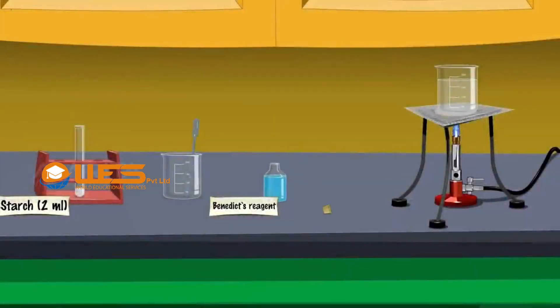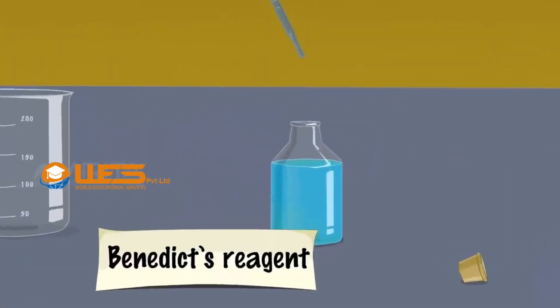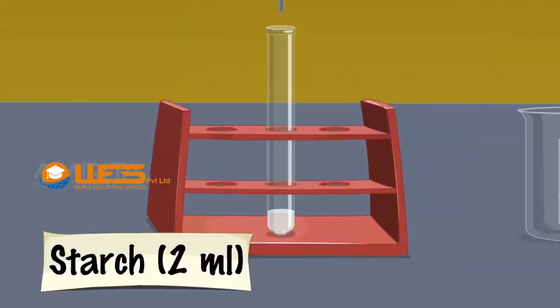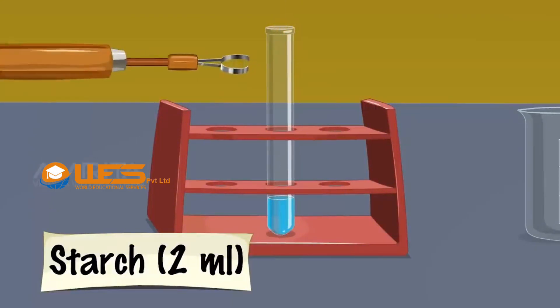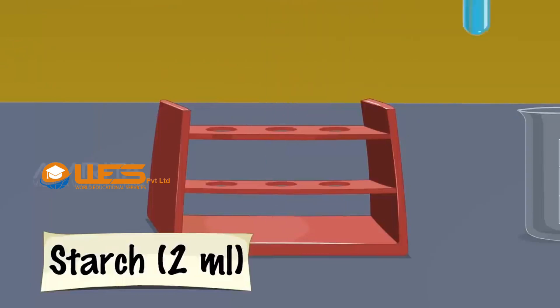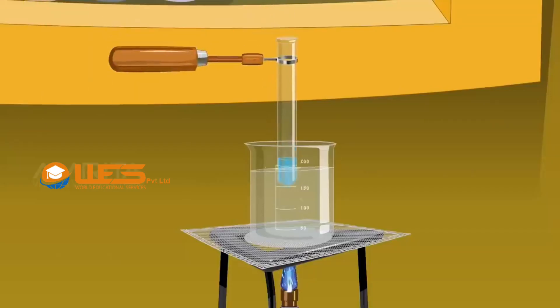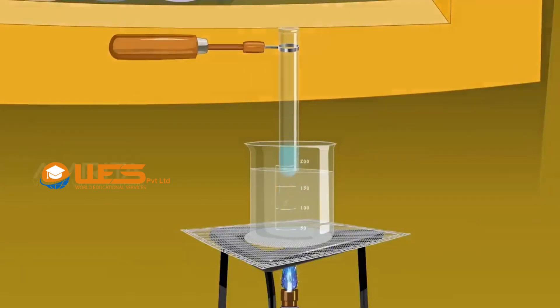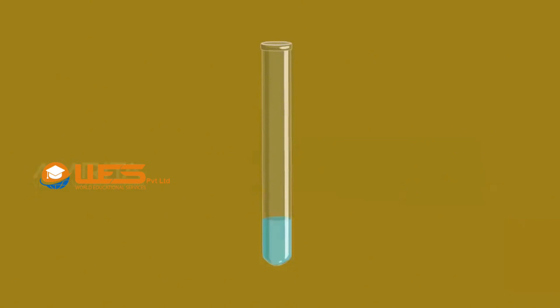Starch. Take 2 ml of Benedict's reagent in a dropper. Add it to 2 ml suspension of starch taken in a test tube. The colour of the solution turns blue. Remove the test tube from the rack using a test tube holder. Place it in a boiling water bath and heat for a few minutes. The colour remains the same. The test is negative, indicating that starch does not contain reducing sugar.